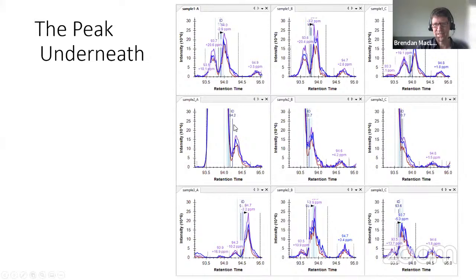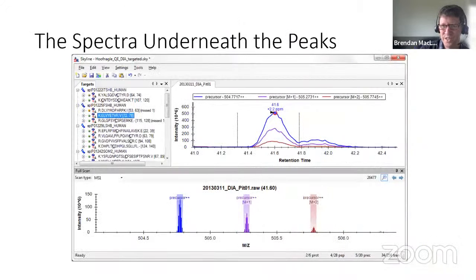That's not changing significantly. But I would tell you that there's no tool, MaxQuant, no, Proteome Discoverer, there's no tool that's going to see this thing over here as anything but a shoulder on that big peak. So I think a lot of tools are going to make a mistake like this, and it's only through being able to zoom in and do directed investigation, when you're like, yep, this is a great thing, I'm going to publish, and then you use these tools, you can learn more and maybe save yourself some mistakes.